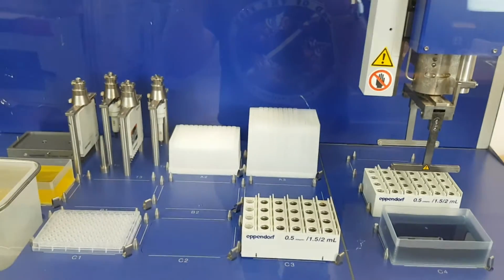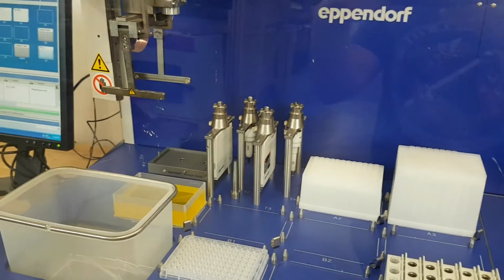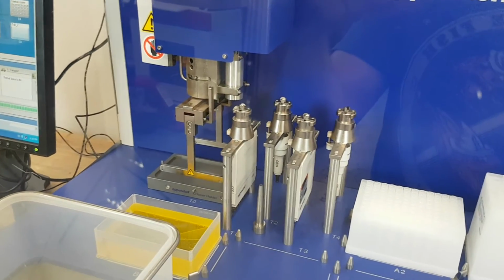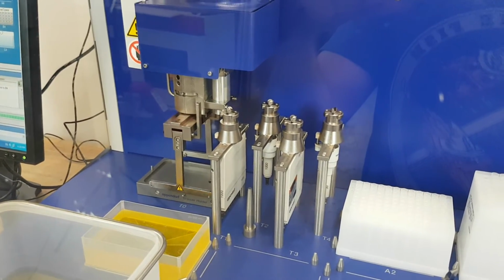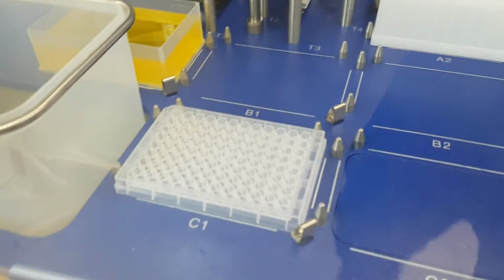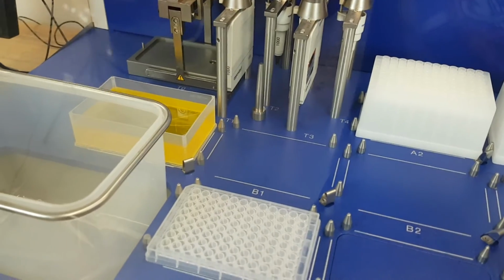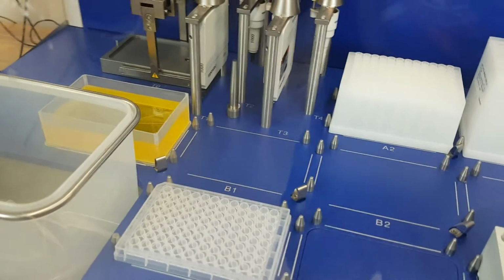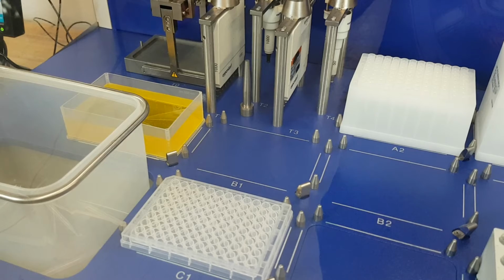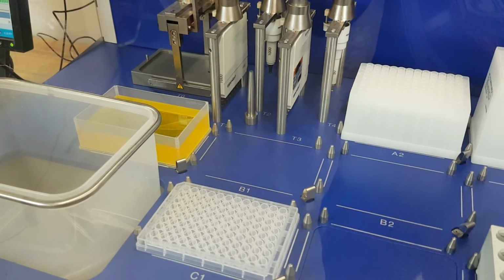The final demonstration we have for you is the use of the 8-channel pipetter. So after it puts this down, it'll take the 50 microliter 8-channel pipetter and take some of the yellow liquid, which is now close to the 96 well plate, and move it right into that first set of wells. And after that, we will check in on the temperature again, show you that the heater is working well, and that'll be all for this demonstration.